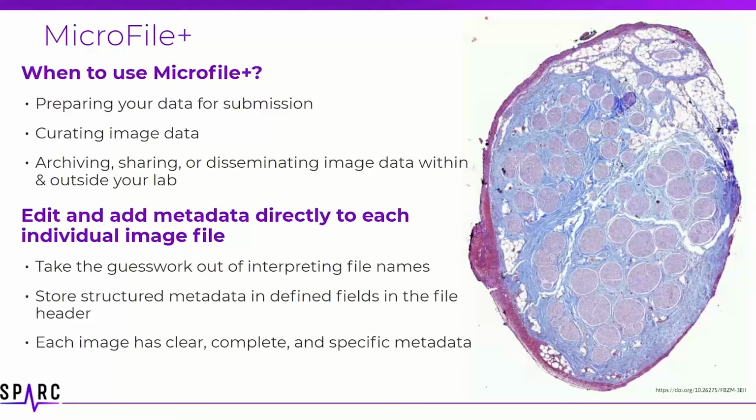Since you are the experts of your data, though, using MicroFile Plus prior to dataset submission will help expedite that curation process and get your curated data onto the portal faster. Yeah, MicroFile Plus can also be used as a resource within your lab outside of SPARC. By writing the metadata required for image interpretation directly to the image file, it's easy to archive microscopy image data that you may reuse in the future.